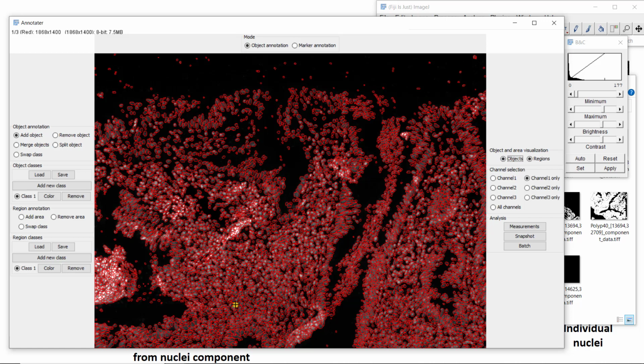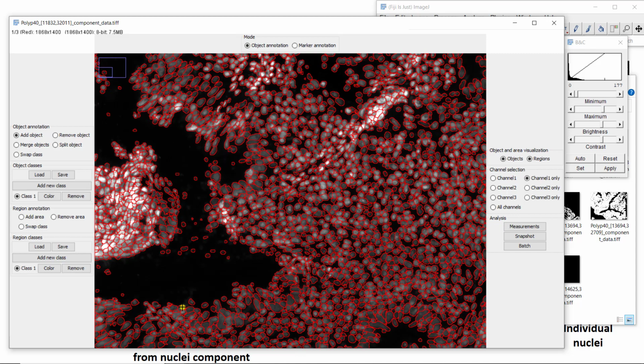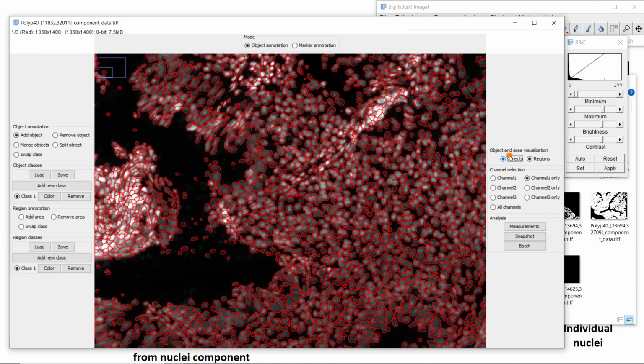As you can see, it's already not that bad. We didn't use that many images, just 4 images like this. Let's zoom in. Obviously it's not perfect. In this stromal area, it's pretty good, I would say. I don't know if it's perfect, but if you look at these nuclei, which again have a very high density, the segmentation is pretty accurate.